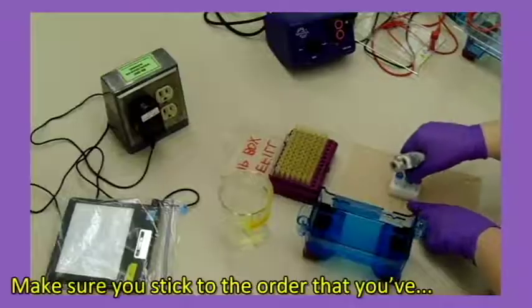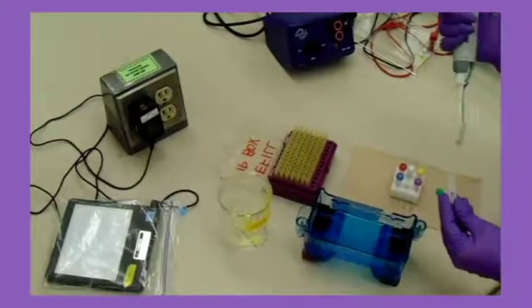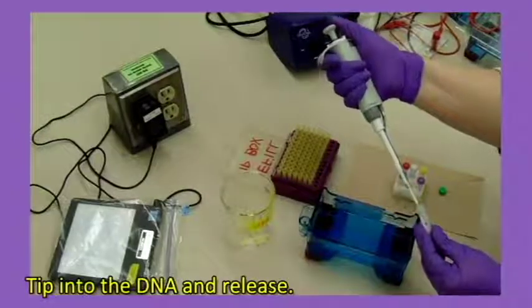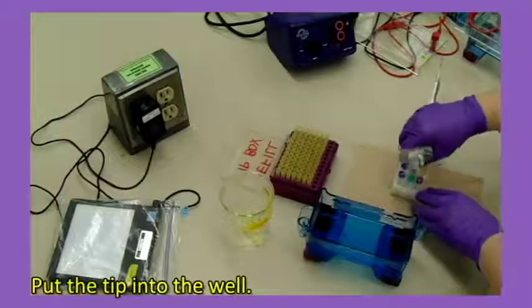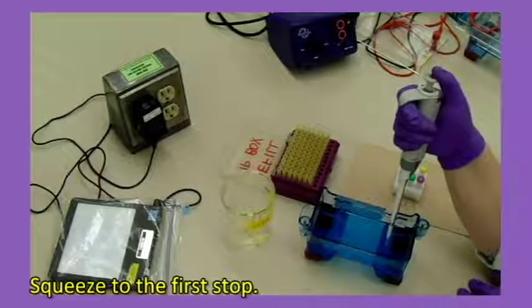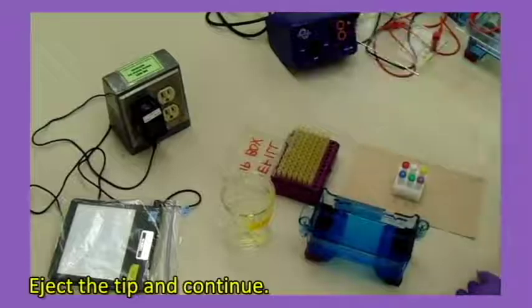Make sure that you stick to the order that you've planned and pick up the next tube. Press to the first stop and hold. Tip into the DNA and release. Put the tip into the well. Squeeze to the first stop. Remove the tip from the buffer and release. Eject the tip and continue.